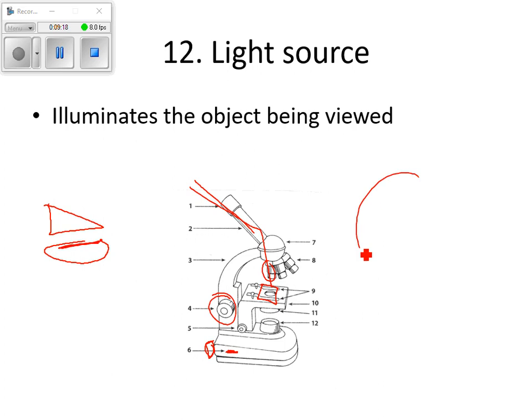The biggest tip I can give you is this. When you look through the eyepiece, and this is super important, because otherwise you're going to call me and I'm going to be like, well, I don't even see it, first of all. On low power, before you do anything else, the very first thing you need to do is look through the eyepiece here, and you're going to see a little pointer here.